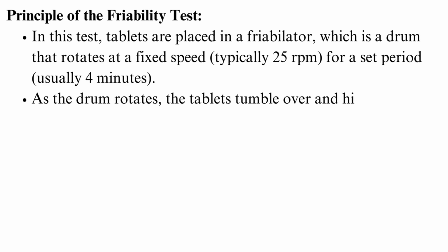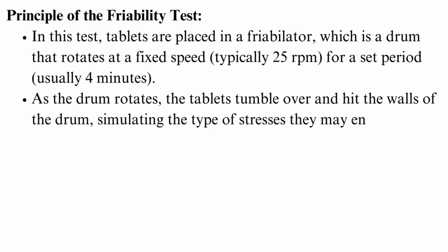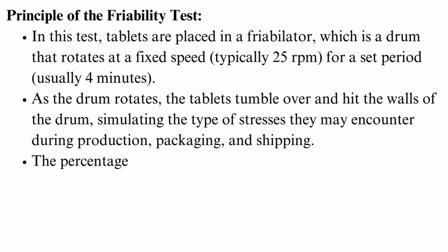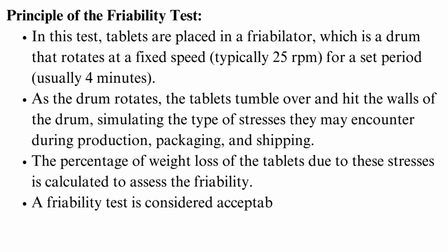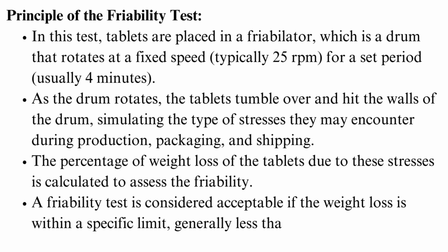As the drum rotates, the tablets tumble over and hit the walls of the drum, simulating the type of stresses they may encounter during production, packaging, and shipping. The percentage of weight loss of the tablets due to these stresses is calculated to assess the friability. A friability test is considered acceptable if the weight loss is within a specific limit, generally less than 1% of the initial tablet weight.